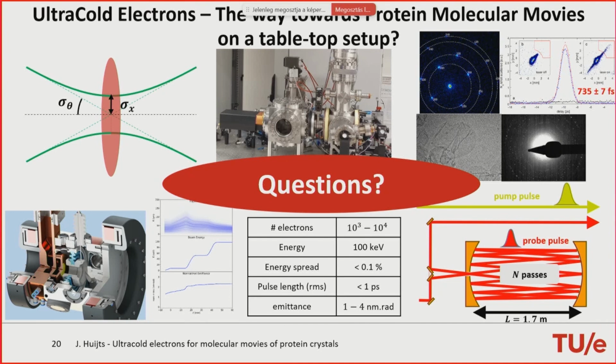Maybe it's cheaper at least. So there's indeed SLAC. There's one at DESY too. China. There's REGAE at DESY. One in Dortmund, I think. So they're building one in the UK as well. So it would still be, I think, an order of magnitude smaller and cheaper.